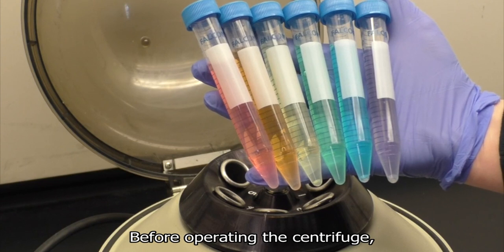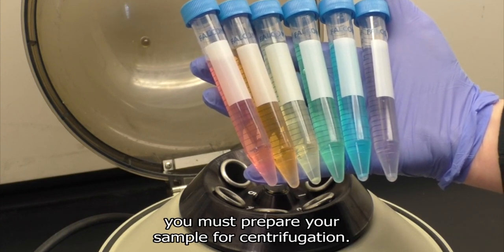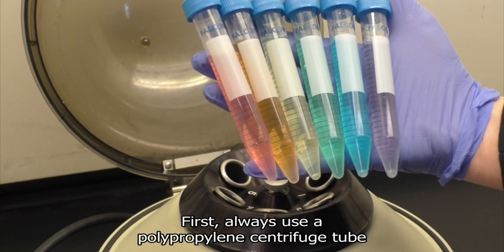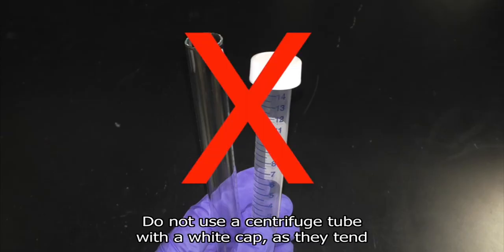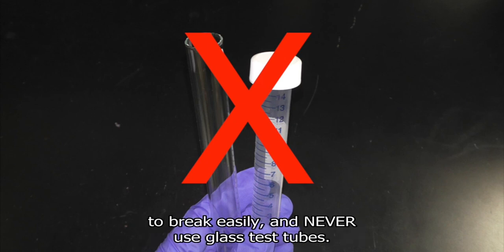Before operating the centrifuge, you must prepare your sample for centrifugation. First, always use a polypropylene centrifuge tube with a blue screw cap. Do not use a centrifuge tube with a white cap as they tend to break easily, and never use glass test tubes.